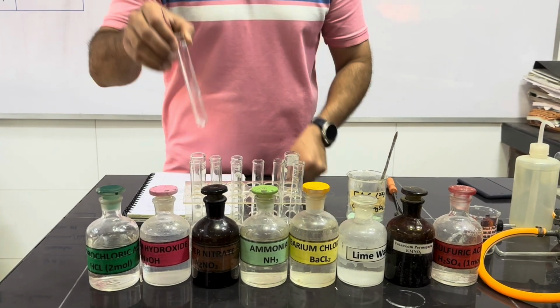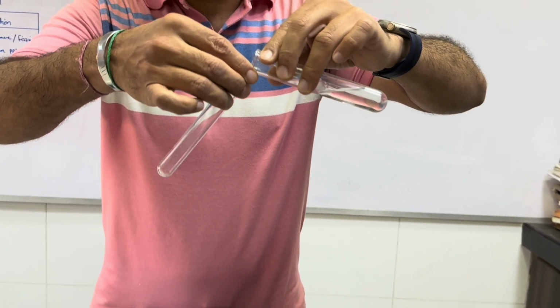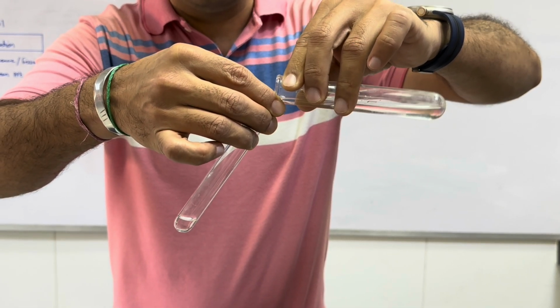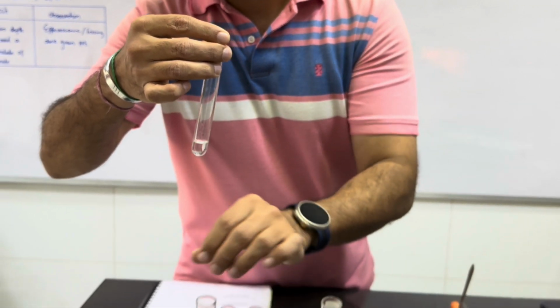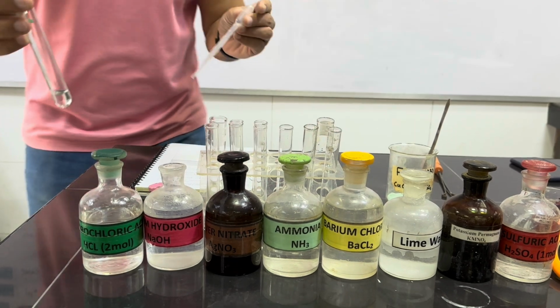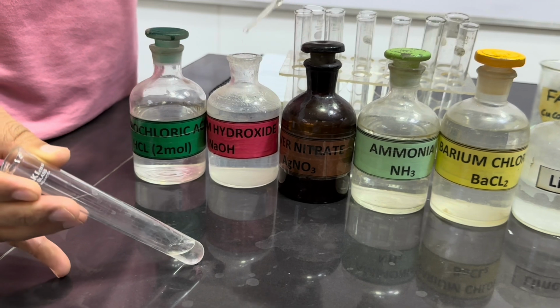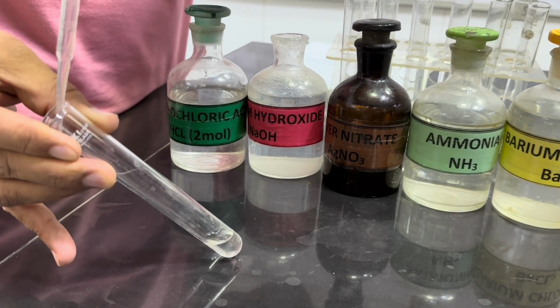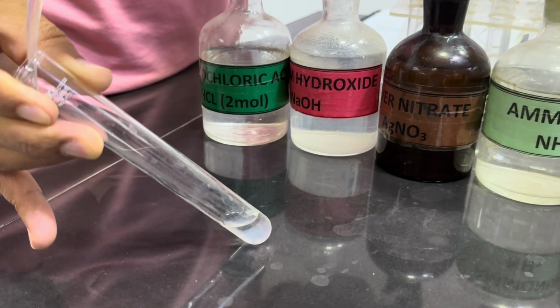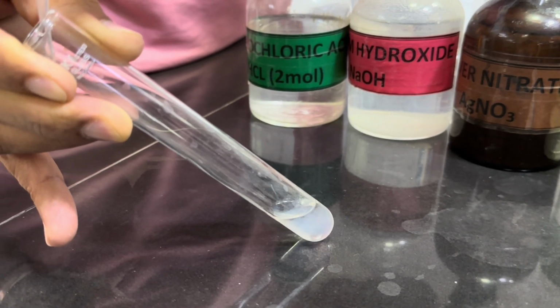Now we will take 1 centimeter depth of this solution, and we will take sodium hydroxide to test this. First of all, we will add in a few drops followed by excess. So here we can see, if we add few drops first, solution is turning into white precipitates.